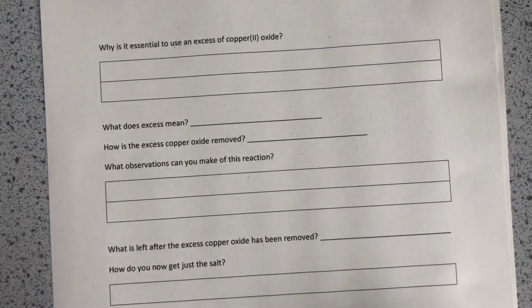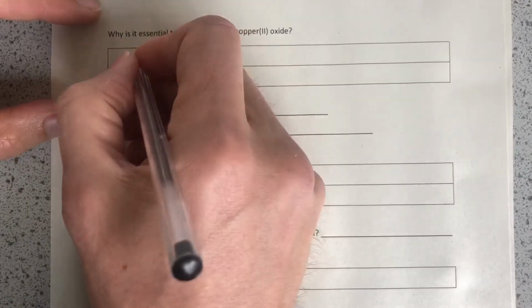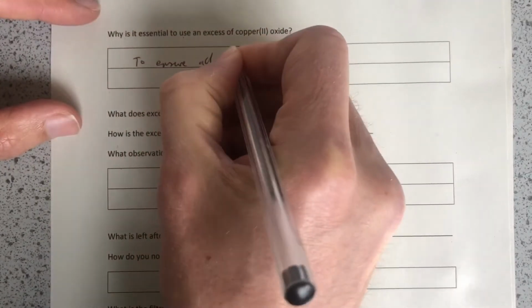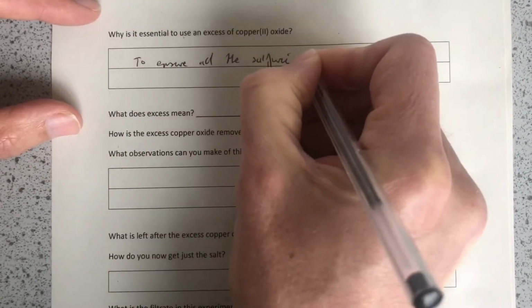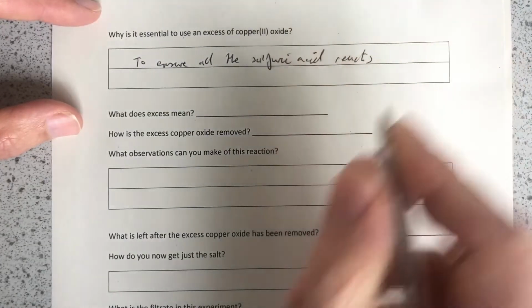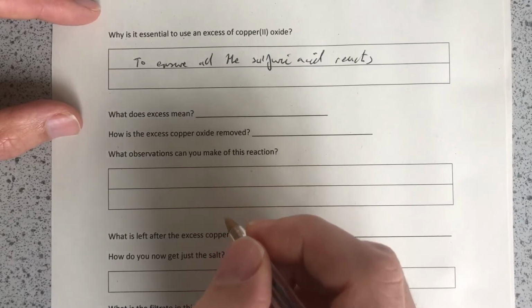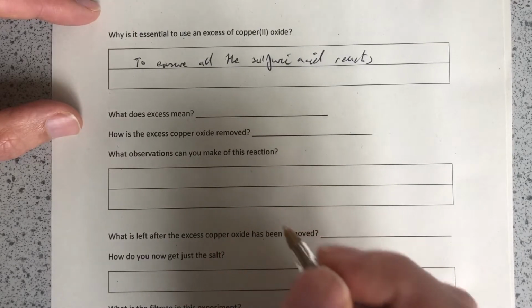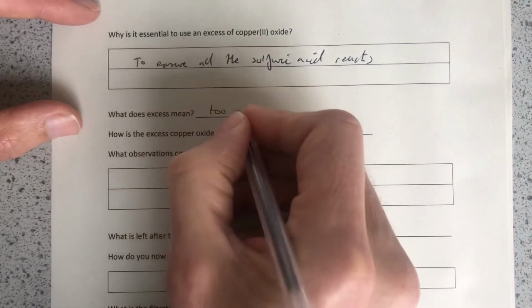Why is it essential to use an excess of copper oxide? Again, it's the same answer as last time, really, isn't it? To ensure all the sulfuric acid reacts. So once that happens, we've got excess copper oxide mixed with the copper sulfate and water, so we do need to separate that. This is a quick answer: what does excess mean? Too much.